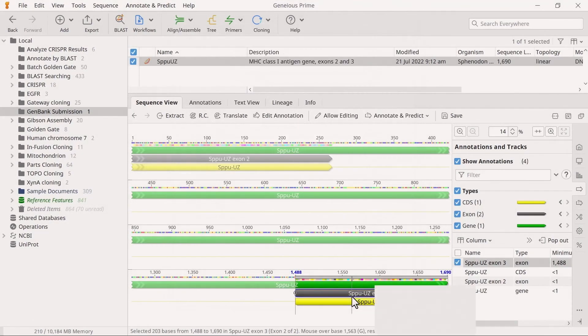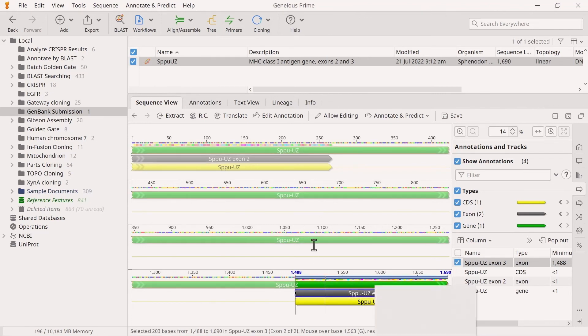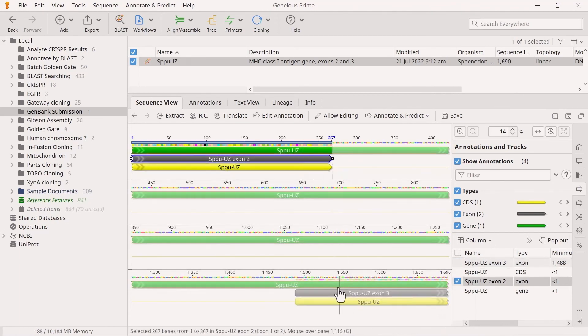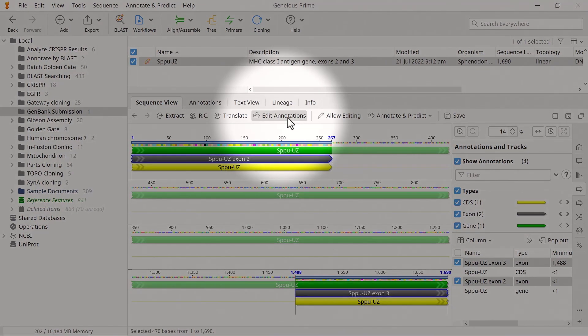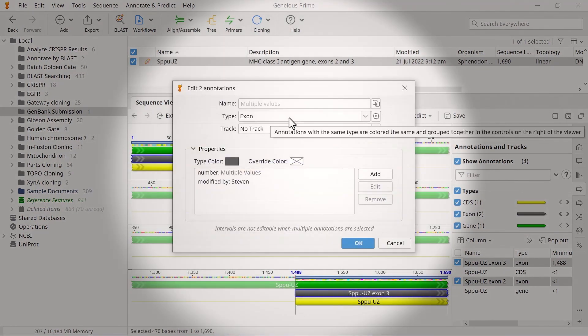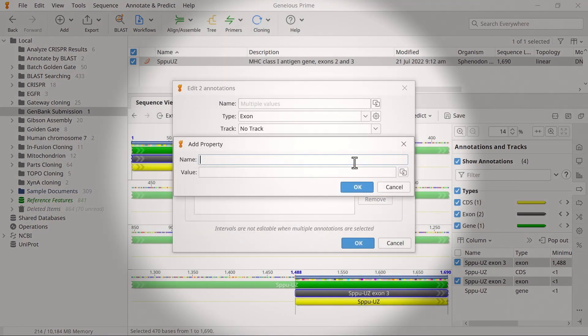As well as adding a number qualifier, it's best practice to also add a gene qualifier to all exons. To add the same gene qualifier to multiple exons, hold down the CTRL key and select both exon annotations. Then go to the Edit Annotations window again and add a new entry for the gene qualifier.